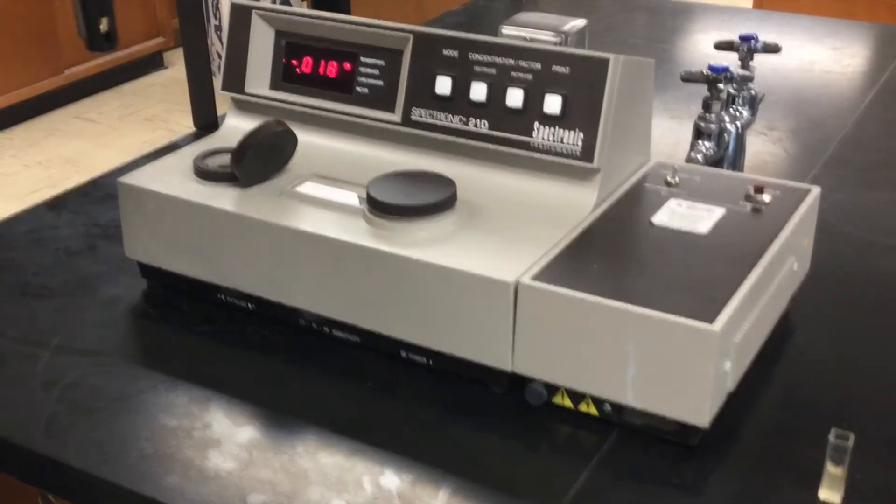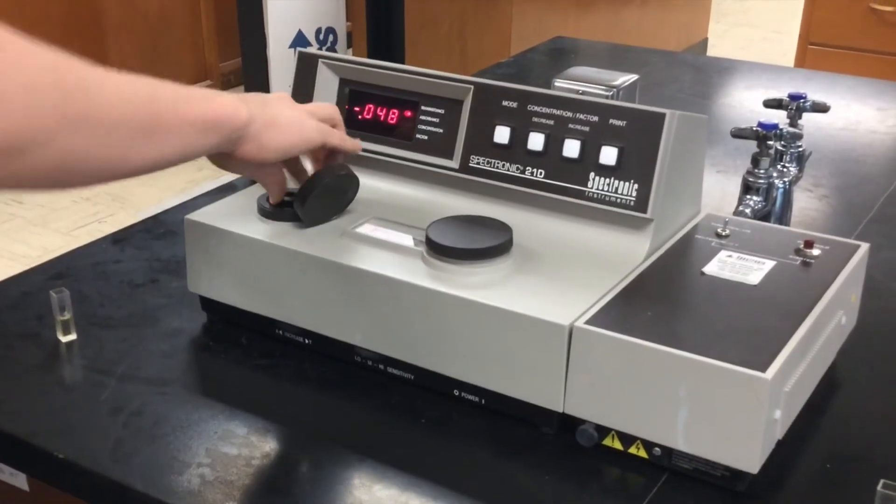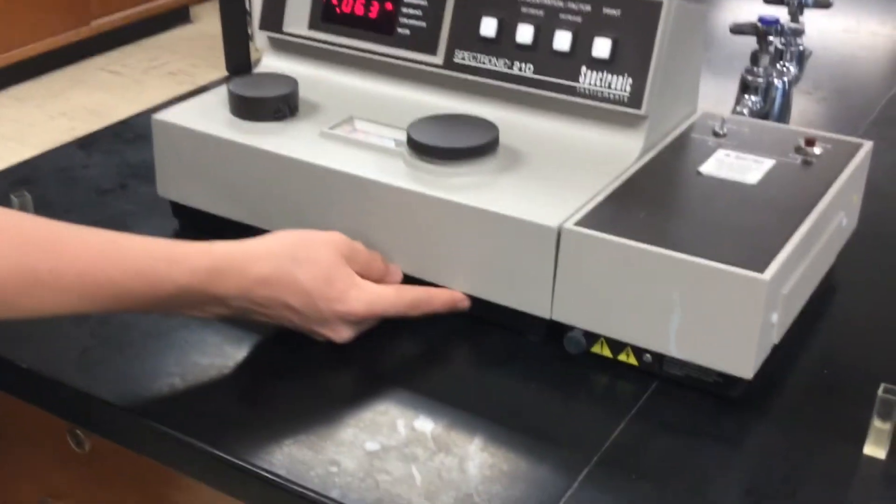Finally, remove the cuvette from the machine, and when you are done, turn it off and return it to its proper place.